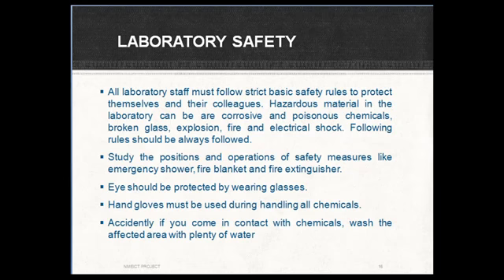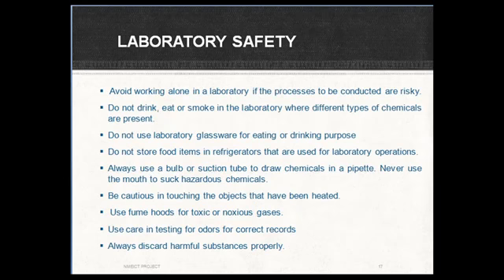Avoid working alone in a laboratory if the process to be conducted are risky. Do not drink, eat or smoke in the laboratory. Do not use laboratory glassware for eating or drinking purpose. Do not store food items in refrigerators that are used for laboratory operations. Always use a bulb or suction tube to draw chemicals in a pipette.